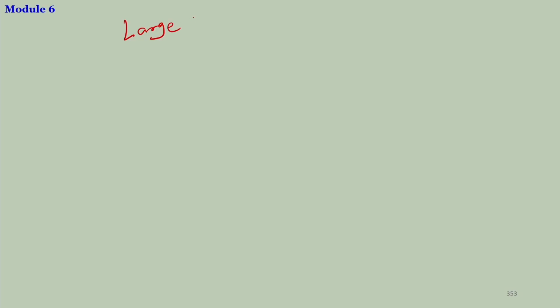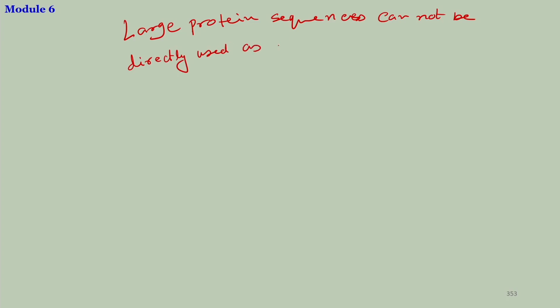So large protein sequences cannot be directly used as sample for protein or peptide sequencing methods.